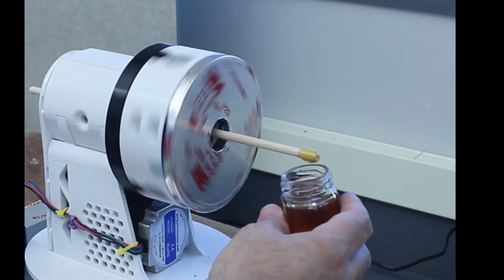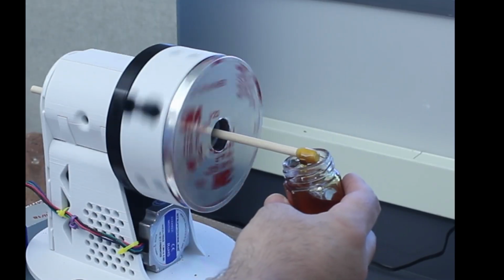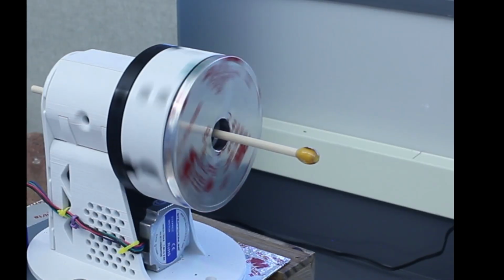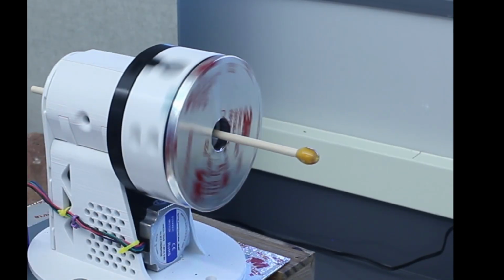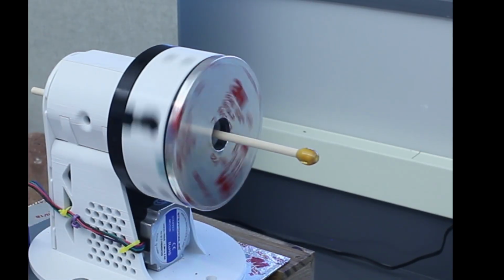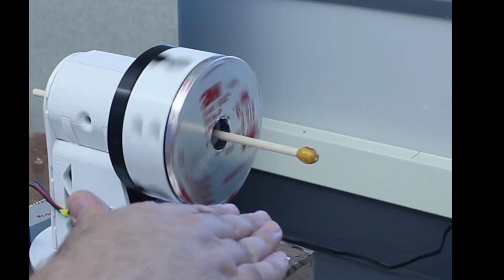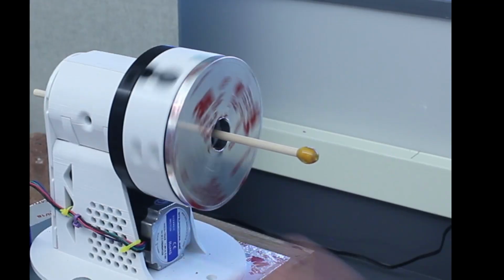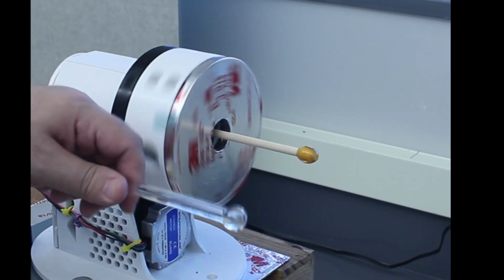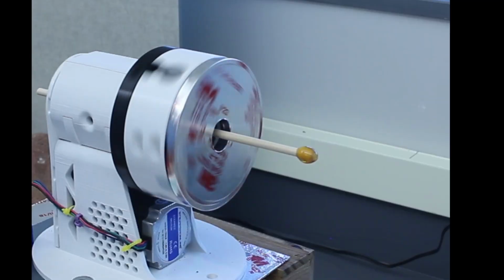And this is one of the things where when you do this by hand, this is a skill that you just have to learn. You just have to practice. In the case of the lathe, it is doing all the significant work. The lathe is holding our dowel rod in position and rotating, and again, this would be a glass rod, and at the end I would be heating it with the hand torch, making my gather. So the ball of honey represents the gather.